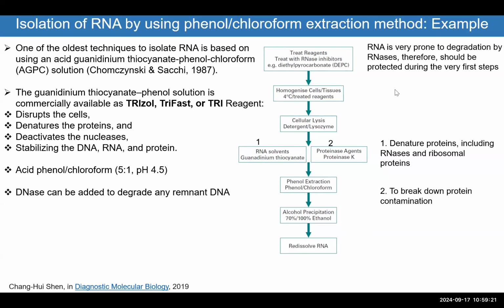So whenever you work with RNA, you have to take good consideration that RNA is very prone to degradation, mainly by the RNases. So you have to protect the RNA from the first steps. Some protocols would use proteinase K, others would use the guanidinium thiocyanate. So in some protocols you find one, and in others you find both.